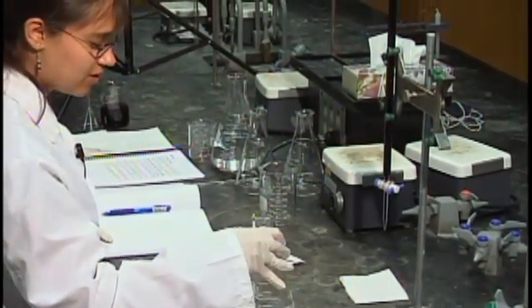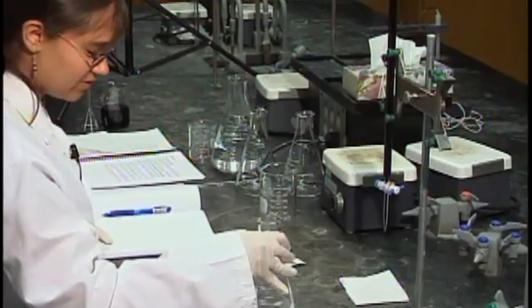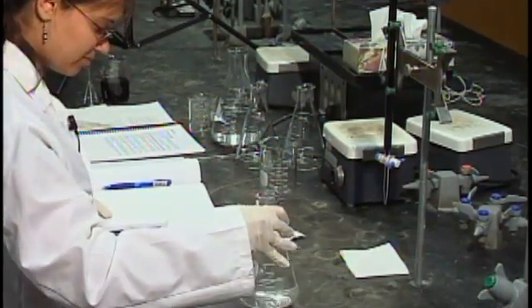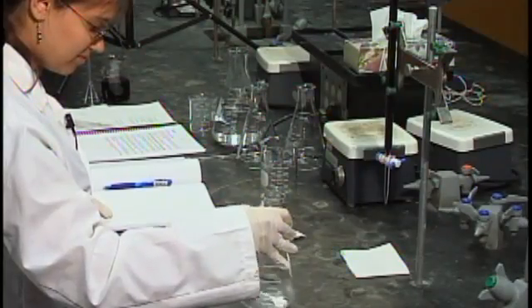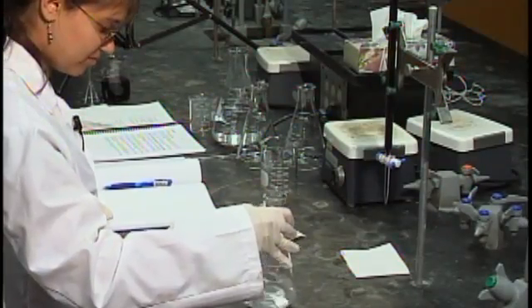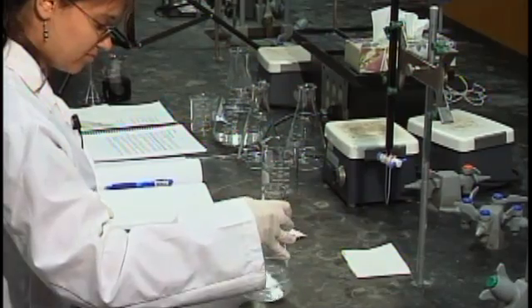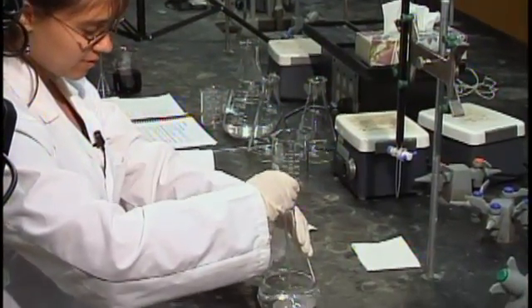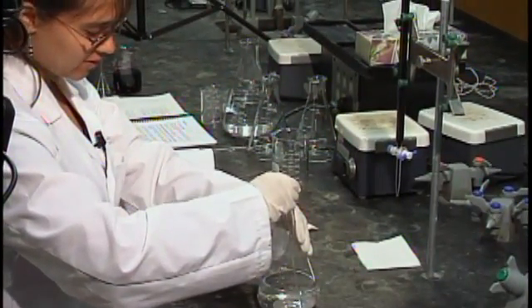And we'll swirl the solution until it dissolves. And if there are any big chunks of sodium oxalate, you can crush them with a glass stirring rod so they'll dissolve.